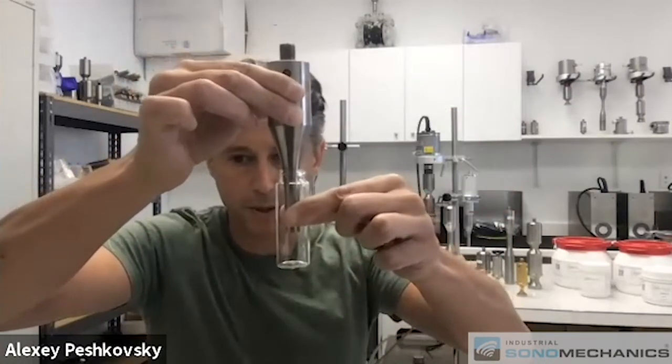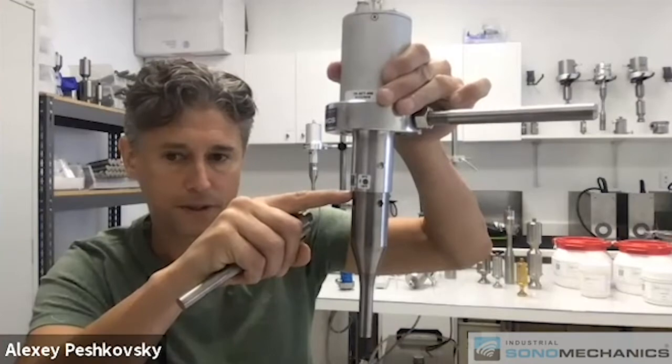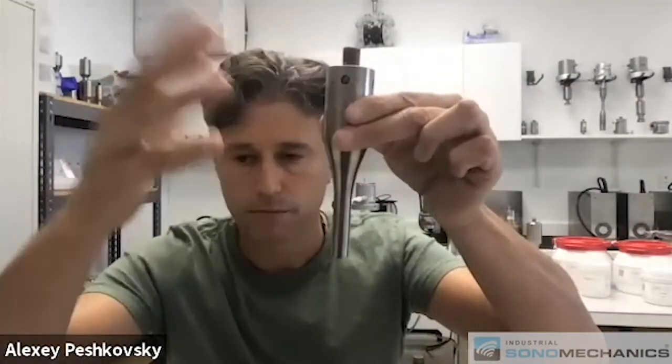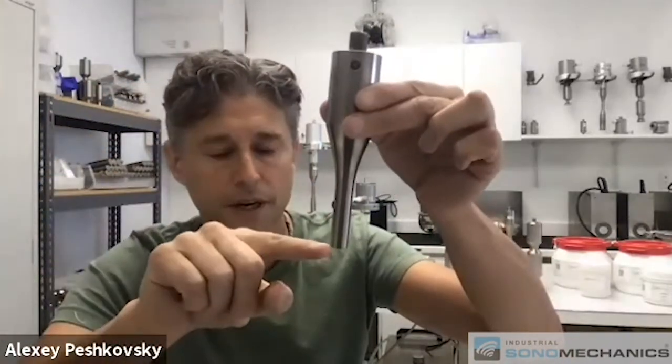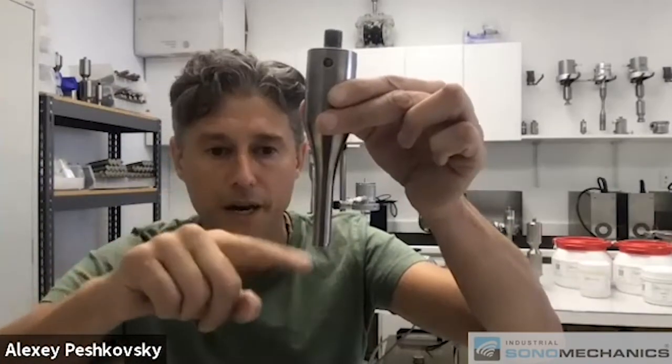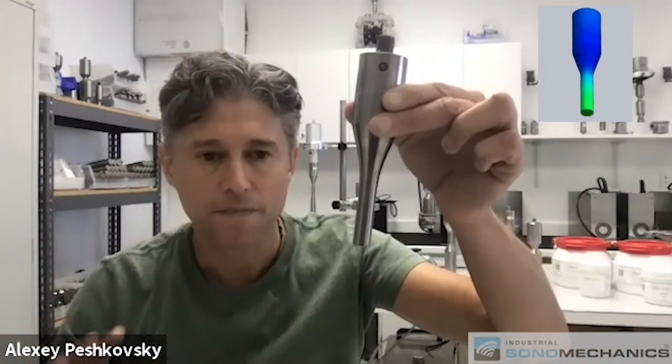There are two aspects of our technology that allow our customers to make their own nanoemulsions. On the hardware side, we offer ultrasonic systems. The unique feature of these systems is that they're directly scalable. This is a typical conventional ultrasonic horn. The transducer vibrates this horn at its input side, and then the horn goes through an amplitude transformation along its length, and in the end, the tip of the horn vibrates up and down with a high amplitude. This distance is in microns — a high amplitude is typically 80 microns or so.